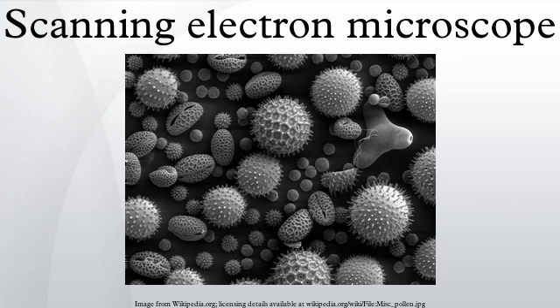In a SEM, as in scanning probe microscopy, magnification results from the ratio of the dimensions of the raster on the specimen and the raster on the display device. Assuming that the display screen has a fixed size, higher magnification results from reducing the size of the raster on the specimen, and vice versa. Magnification is therefore controlled by the current supplied to the X, Y scanning coils, or the voltage supplied to the X, Y deflector plates, and not by objective lens power.